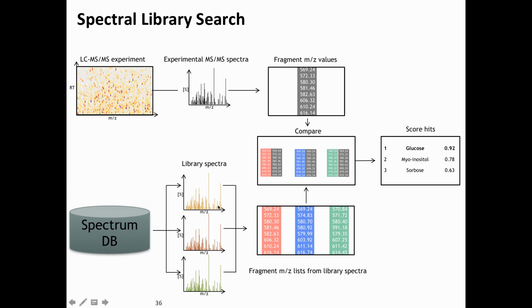But once you have a candidate list, what it does is very similar to the proteomics database search. It has a metric that is usually based on shared peaks or some sort of correlation of the spectra. There are some statistical ways to turn these into meaningful scores, and then you get scored hits in the same way that you know it from PSMs. So this is basically the equivalent of a PSM in library search. It also means you will almost always get something back, and you need to figure out how to deal with that.